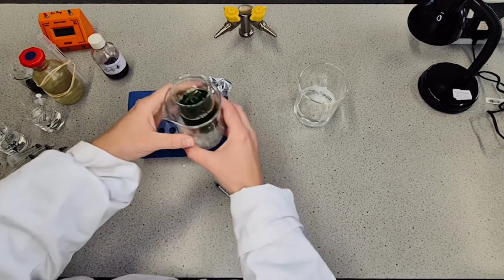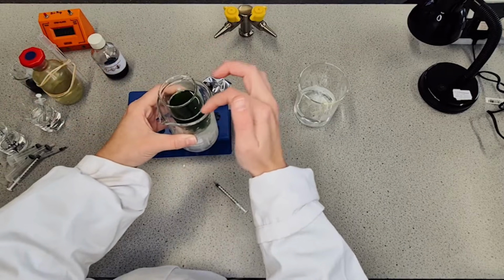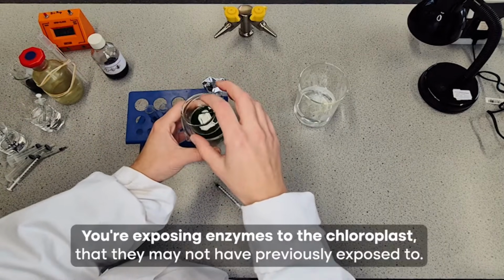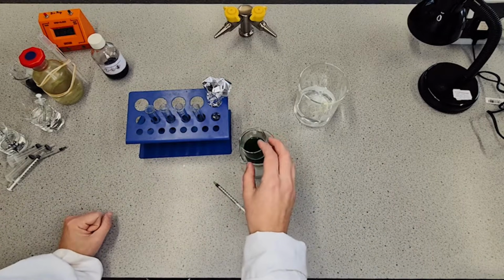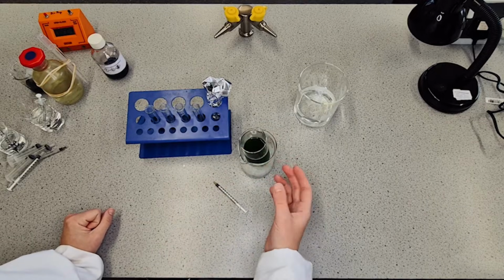Last thing then before we get started is everything has been ice cold, and that's because as soon as you homogenize, so break open the cells, you're exposing enzymes to the chloroplast that they may not have previously been exposed to, and that then means those enzymes could damage the chloroplasts. So they're ice cold so that the enzymes aren't going to be working.